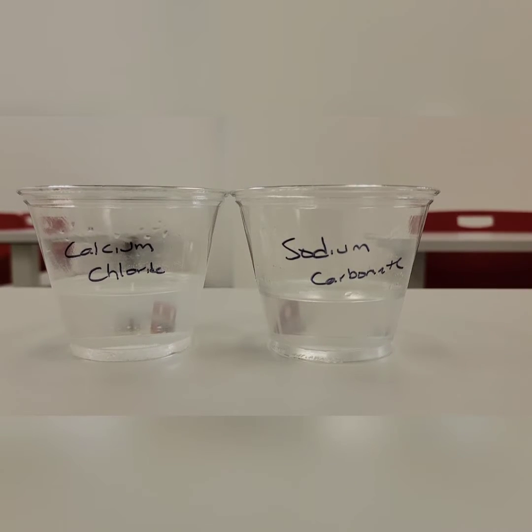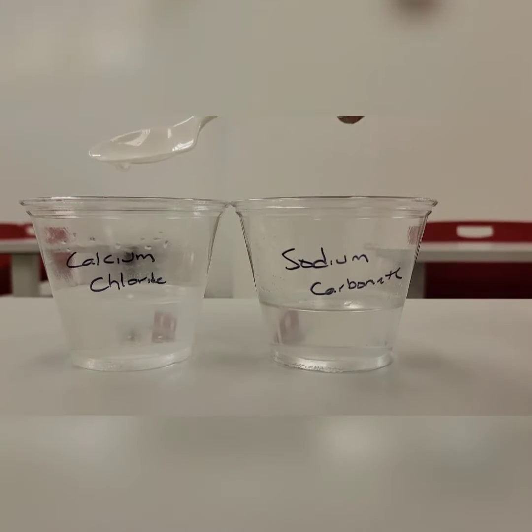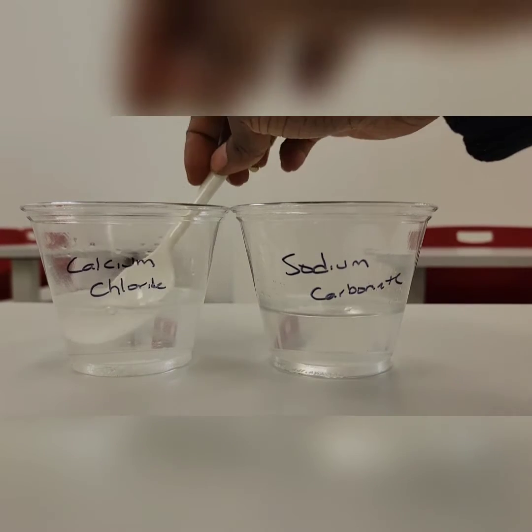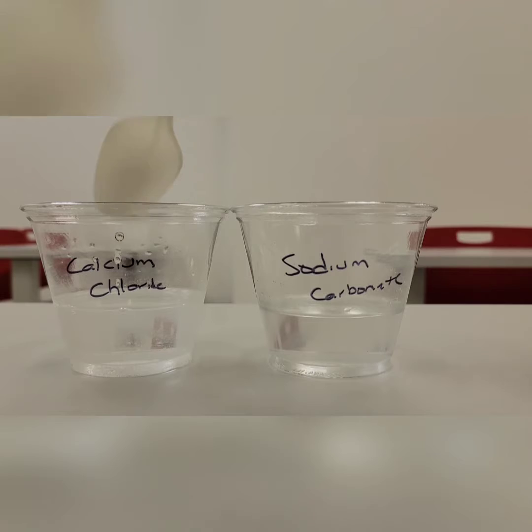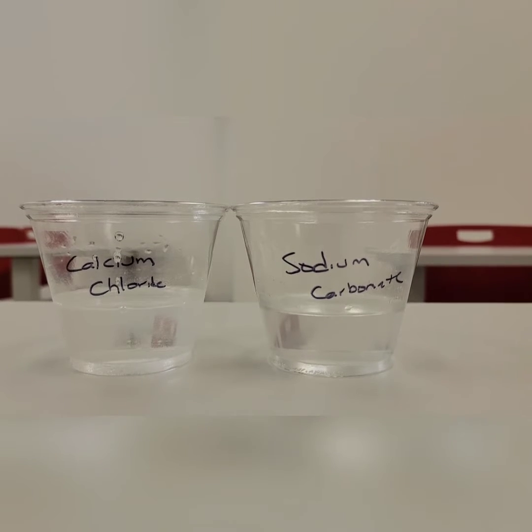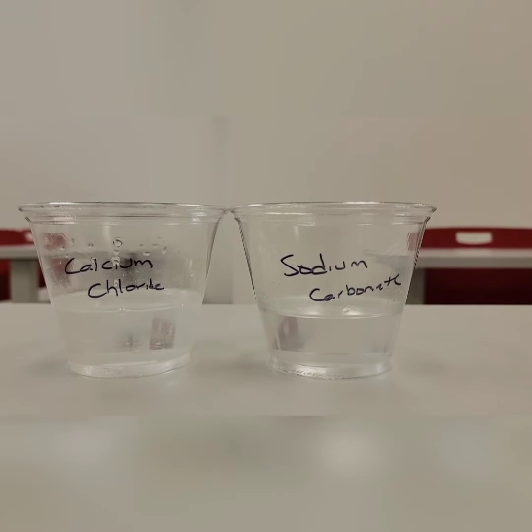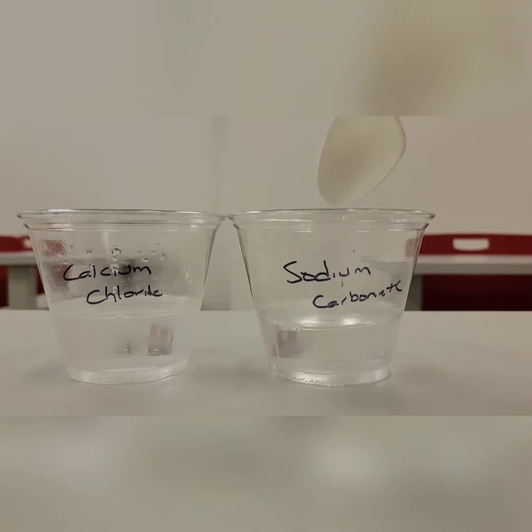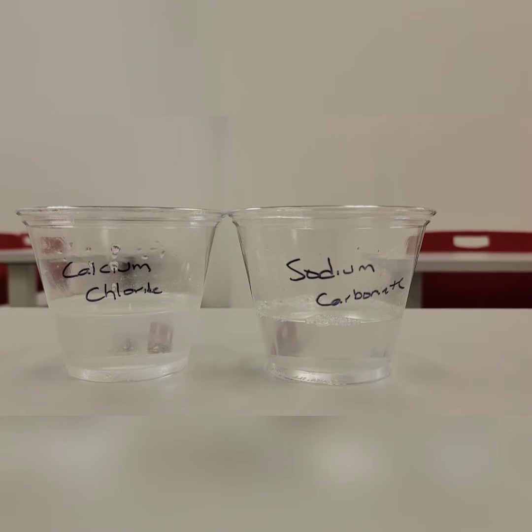Looking at my calcium chloride, it is a clear liquid, and I am just going to use a spoon so you can see the consistency of the liquid. So it is pretty thin, and I am going to do the same thing for the sodium carbonate. It is also a clear liquid. The calcium chloride appears to be a bit more opaque. This one feels a bit thinner than the other.